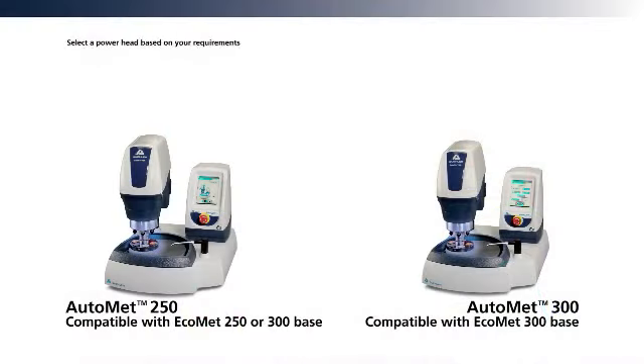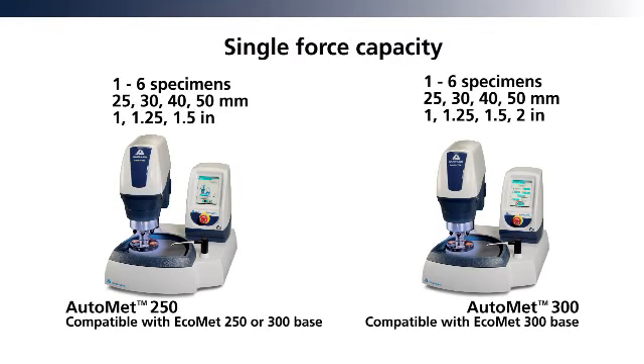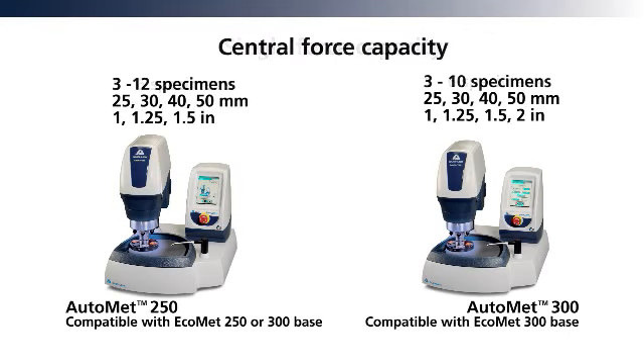The single and central force operation, variable speed reversible powerhead, stops the specimen holder in the same location each time.